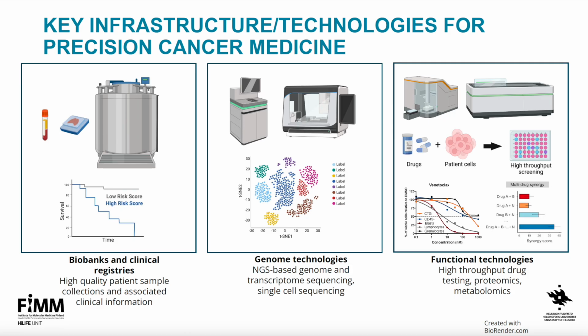And then at the same time, we were setting up our next generation sequencing assays at our institute and our platforms for looking at somatic mutations, for example, in cancer, but then also more recently, of course, single cell technologies as well. But then we've also had very nice high throughput capabilities, mainly where we've been able to apply patient cells to hundreds of different drugs and analyze them using different platforms.